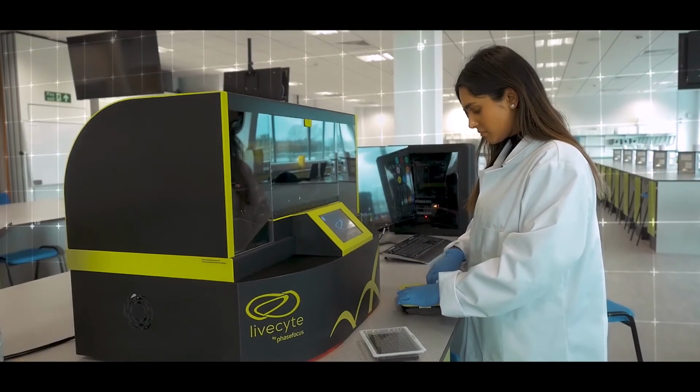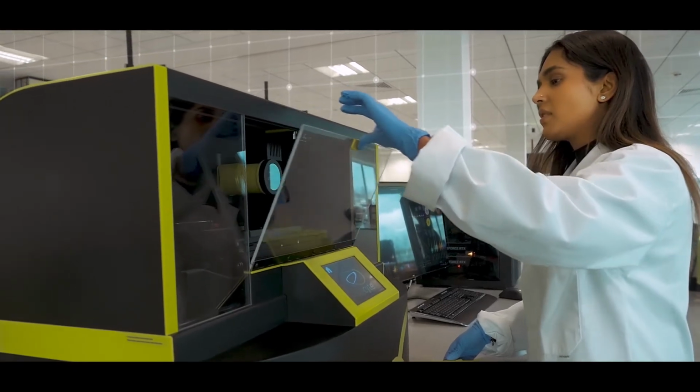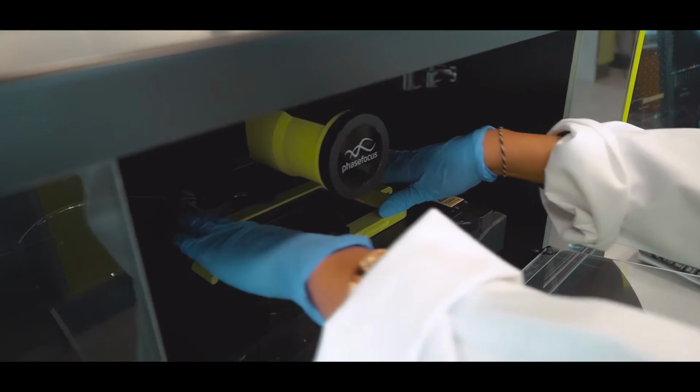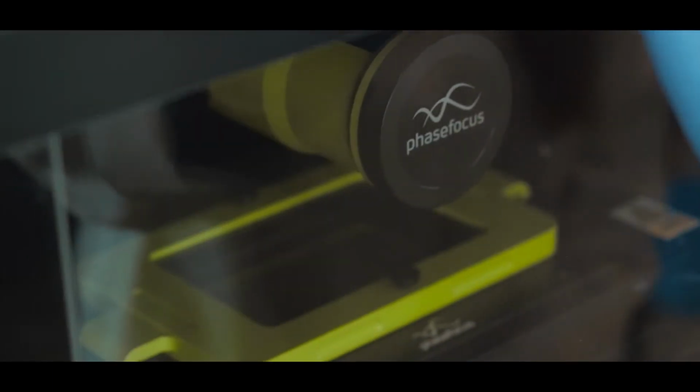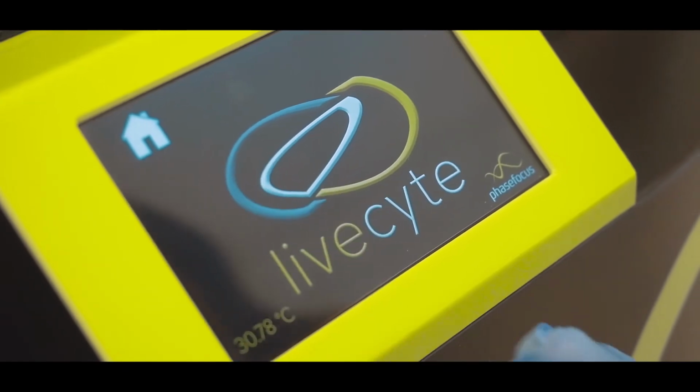Imagine if you could follow thousands of cells over time. You could watch them without influencing the way that they behave. Now imagine you could do that for 96 wells and many different cell populations. You could look at how those cells behave. You could look at how they interact. That's what Livecyte does.